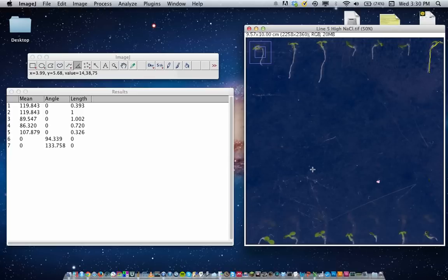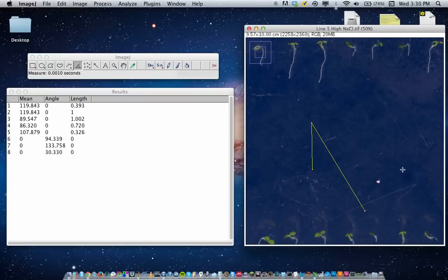So basically, to use this, click once, click again, click a third time, Command M, and that's all she wrote. Good luck. Let me know if you have any questions. Sayonara.